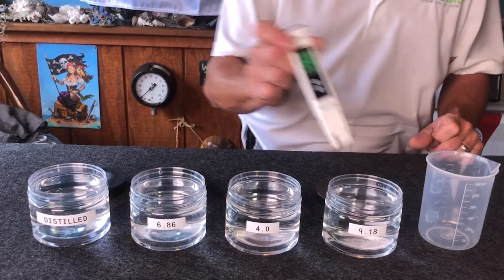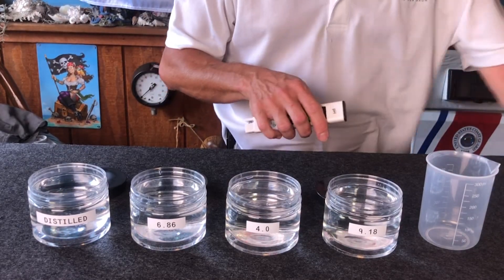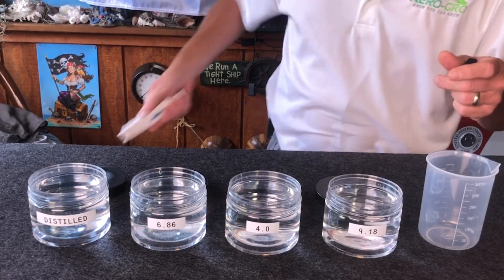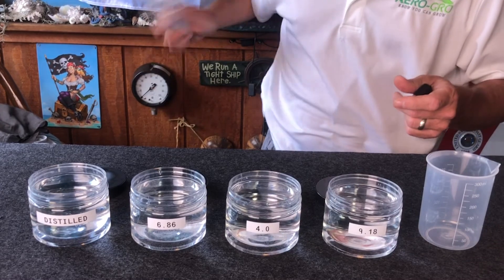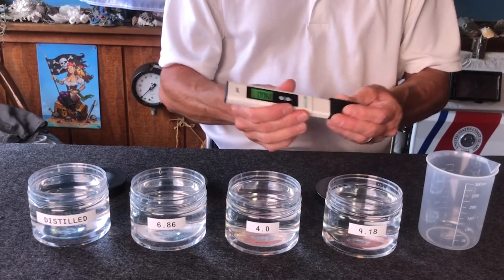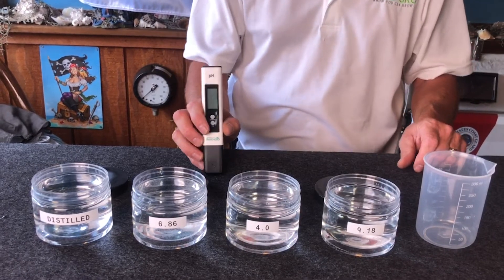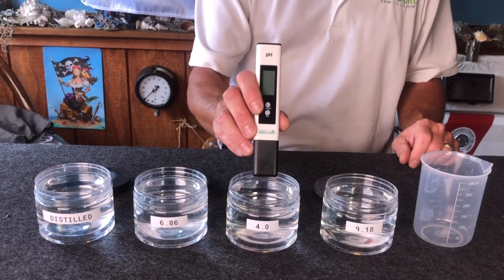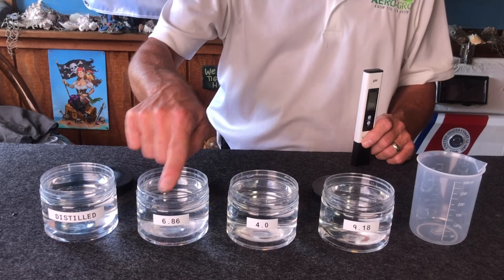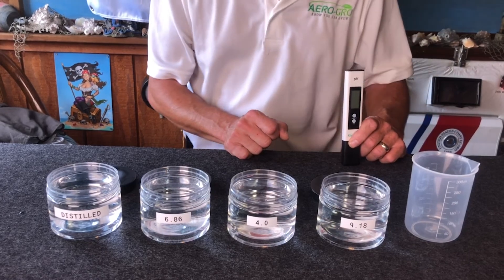Once it's all done, rinse it off and you're finished. A pro tip: once the meter is saturated with water, give it a little shake — hold on so it doesn't go flying — put the cap back on, and turn it off. That's how you calibrate your meter: dip no clicks, dip one click, dip two clicks. Keep them in order — six, four, nine — and you'll get it right every single time. If not, let us know and we'll help you out.